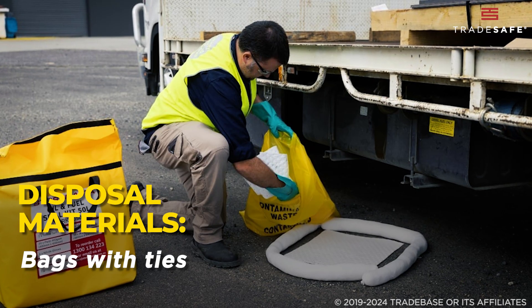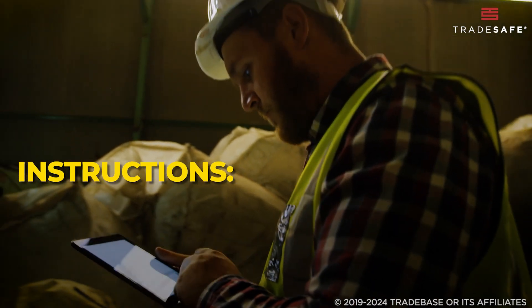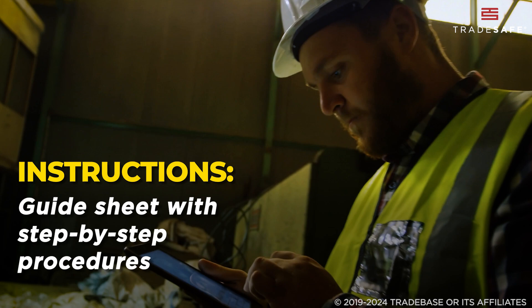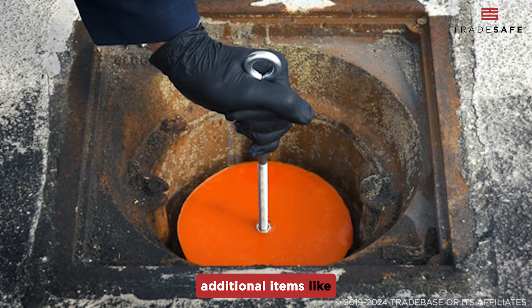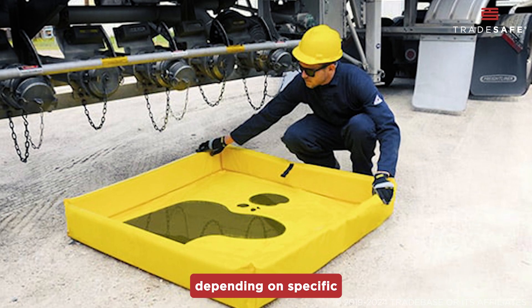Disposal materials like bags with ties for safe disposal of used absorbents. Lastly, an instructions or guide sheet with step-by-step procedures on how to use the kit and its components. Some kits may include additional items like drain covers, floor plugs, or berms depending on specific workplace needs.